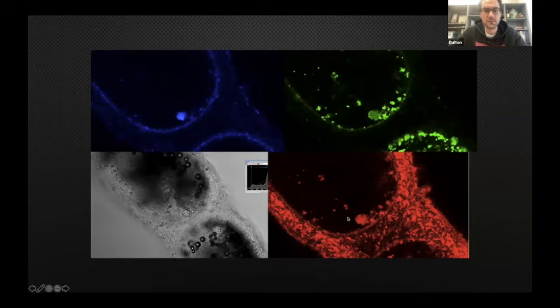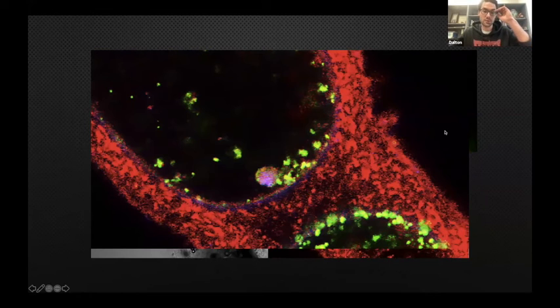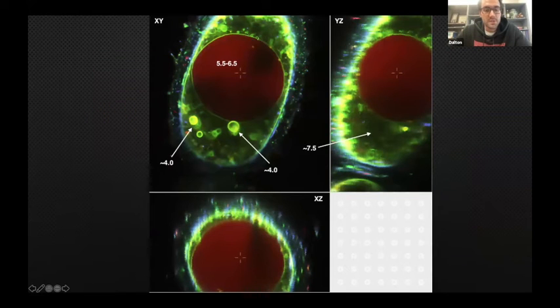This was kind of early on when I was doing some of this work, and I don't think I was using the BODIPY, or the fatty acid stain, long enough. As you can see, Thiomargarita has a very thick sheath, so that's just a lot of distance to travel through. So when I stained longer, I ended up noticing that not all, but a lot of Thiomargarita cells have this large central vacuole in them, kind of seen in the first image from the Schulz paper that I showed earlier.